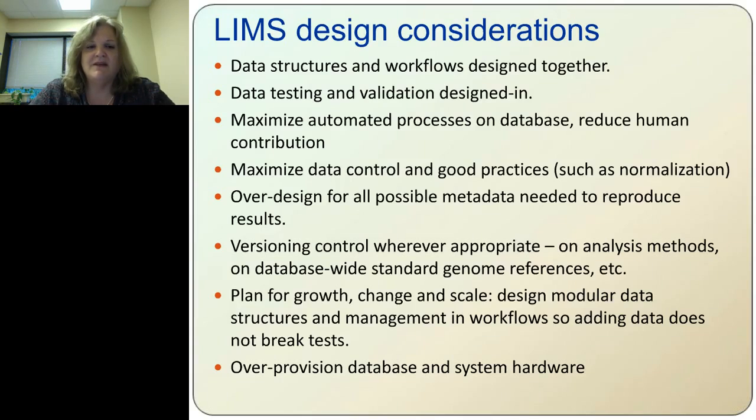A lot of good LIMS are probably built like that in the commercial world as well. We also over-provision the database and system hardware. We try to buy more than we need because we're always growing, and we don't want to suddenly say, oh, we need a new system because it's getting too tight. We want to have a lot of advanced notice for that.